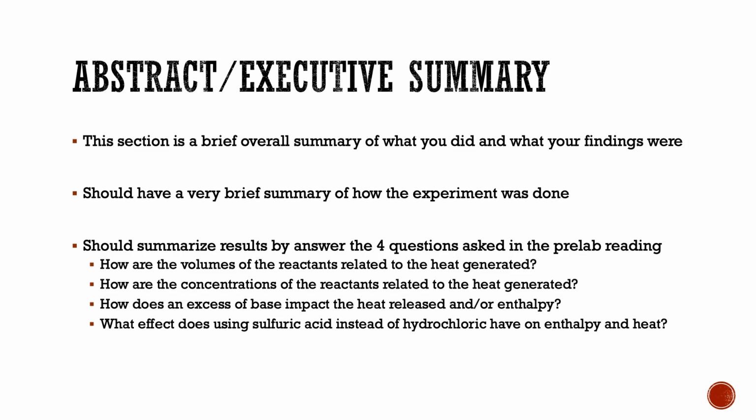Right? How are the volumes going to impact the heat generated? How do the concentrations impact the heat that's generated? Does the excess base impact the heat that's released, or the enthalpy for that matter? And then the last thing, what happens if you switch sulfuric acid for hydrochloric? What does that do to enthalpy and heat as well? And so it's mostly focused on heat here.